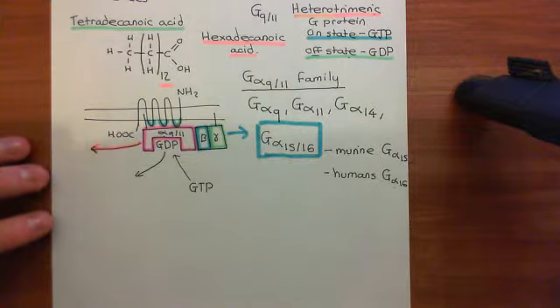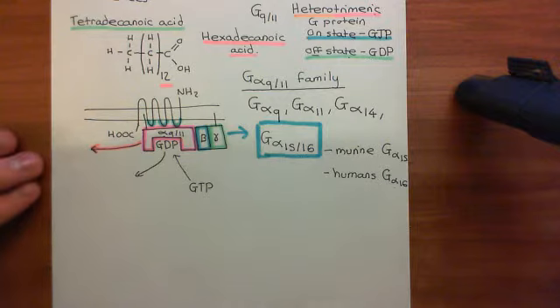So you want to see how activating a receptor on the surface of the cell membrane with its ligand can then cause an increase in the intracellular calcium concentration. Okay, so you want to study calcium signaling basically.